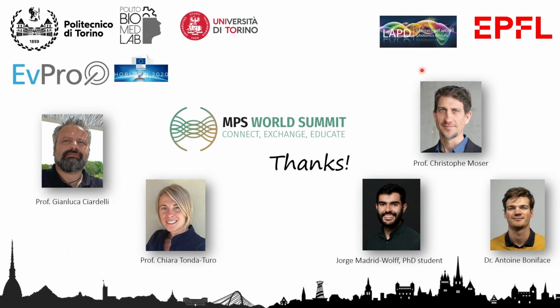So these are materials that can change their biophysical properties not only in response to user input, but in response to cell input as well, in order to create a more biomimetic environment that can be used for drug screening or to probe the mechanisms that cause these transitions between states. How do you see these kind of materials being used in your own research?